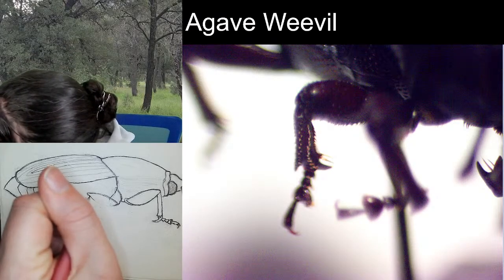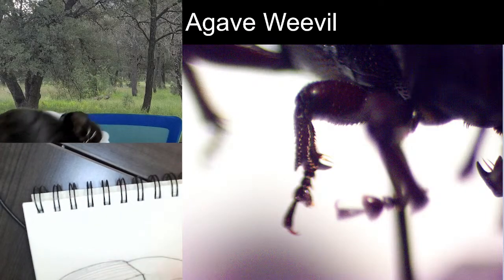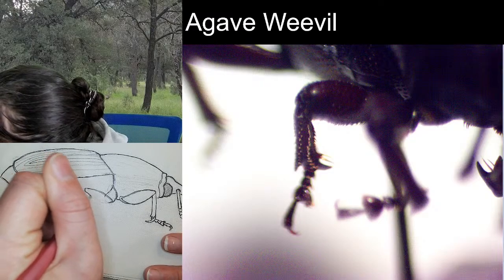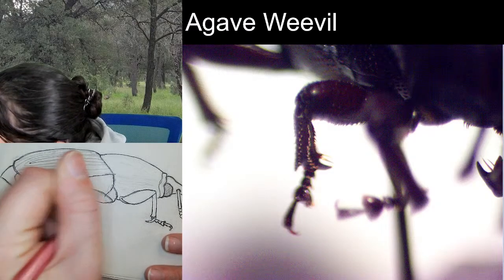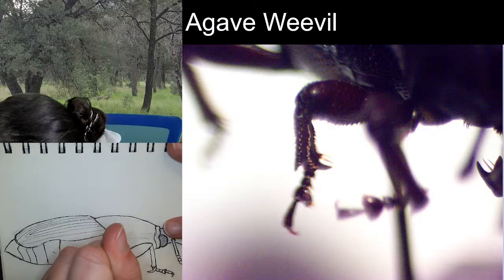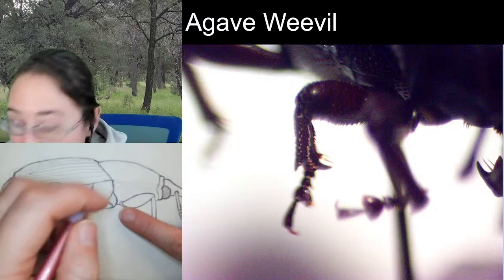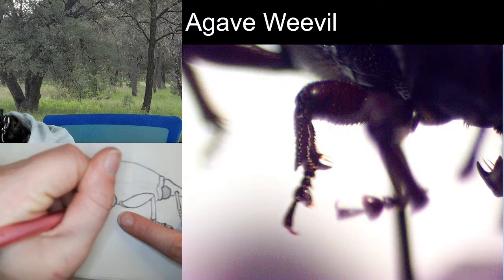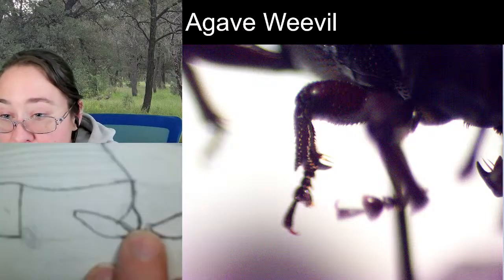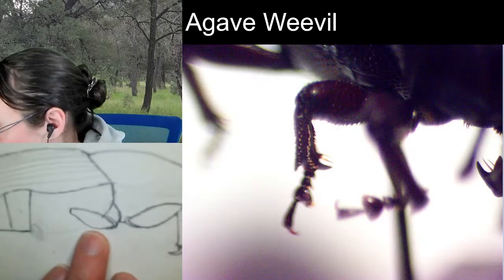And instead of having a point at the end of the femur, it's kind of flat down there. It's narrow for a moment and then it gets nice and wide. And then, if you would like, we can also draw the trochanter from this view. You might be able to see a little sliver that would be right about here, at the base of the femur. That would be your trochanter.